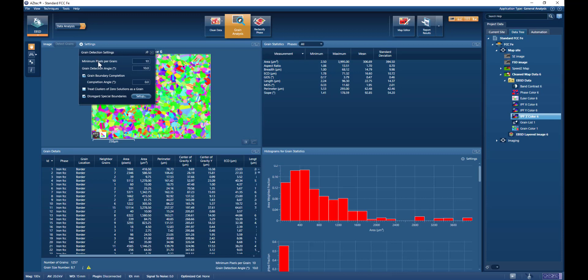We have the minimum pixels per grain, and the recommended default there is 10 pixels, and that is what is accepted in some of the international standards.